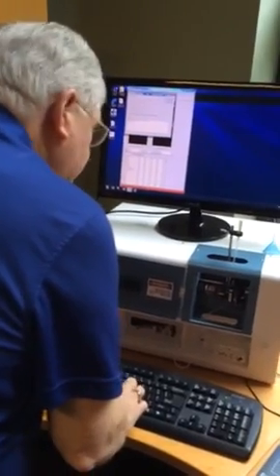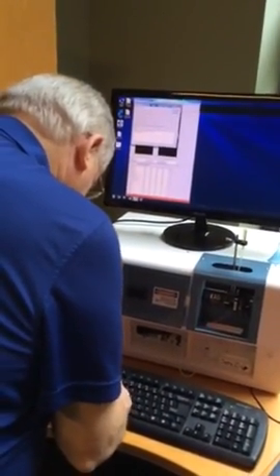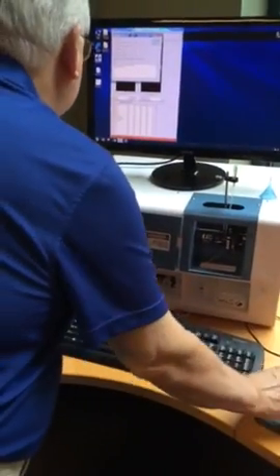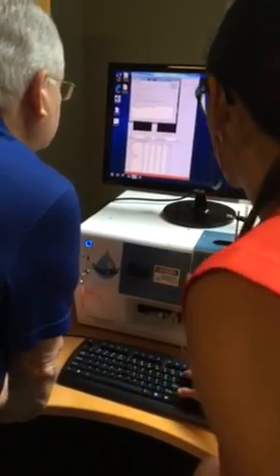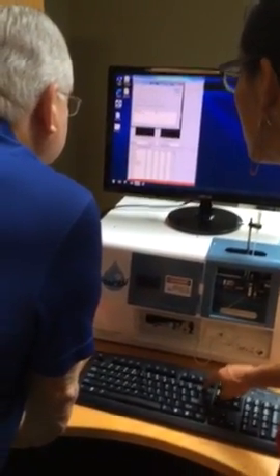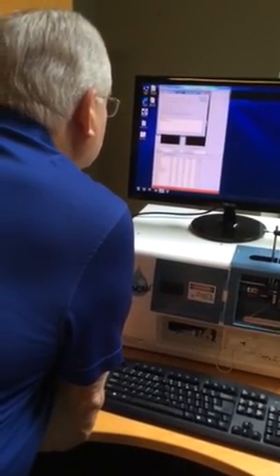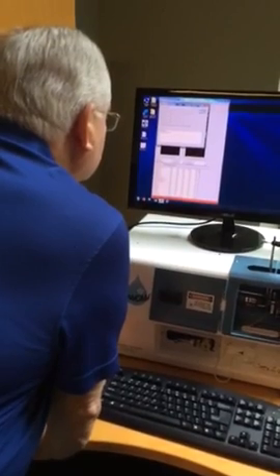And what was that bag? C. Big C. Just for the heck of it. Okay. This is not relevant. Okay, I wasn't sure. And we're going to hit OK.